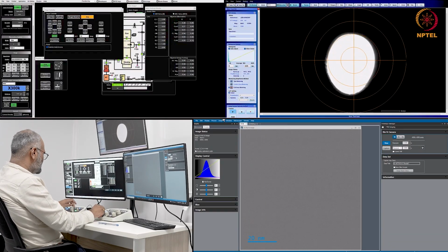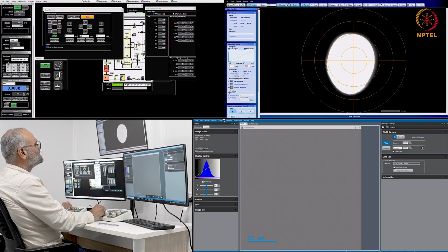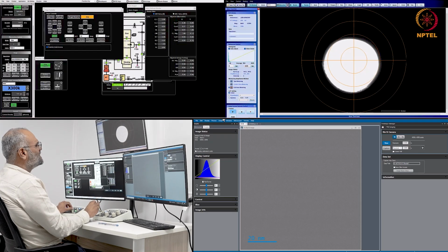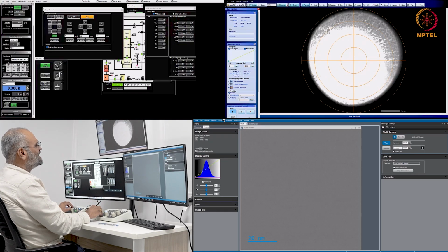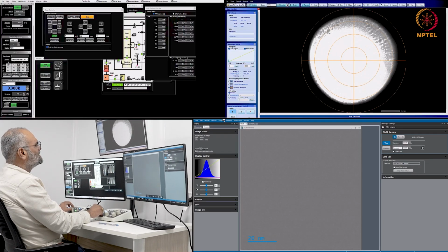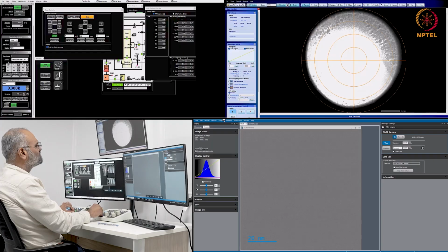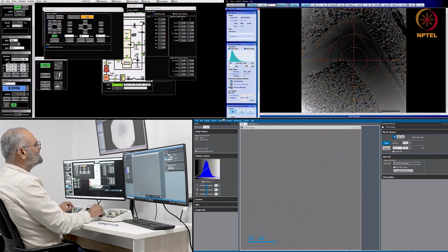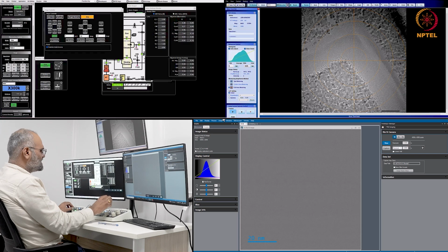So I just click on the condenser stigmation here, and I compensate for the shape of this beam close to the crossover point. I should see that on either side of the crossover, this is nearly symmetric. It's sort of the best case scenario.